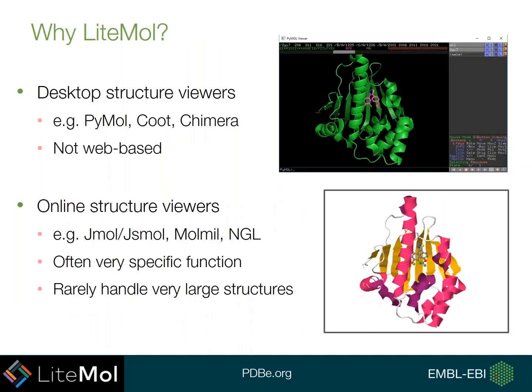So why might you want to use LiteMol? Well, there's obviously a plethora of different structure viewers, and there are a number of desktop structure viewers that are very powerful, programs like PyMol, Coot, and Chimera. And the main problem with these is that they aren't web-based. These require download onto your desktop.